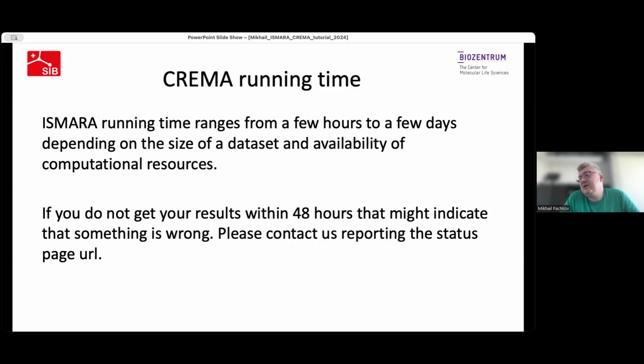So in general, if your data set has a reasonable size, around 20 samples, and it's not finished in 48 hours, then it might indicate that something went wrong, and you can contact us. We will check the status of the job.